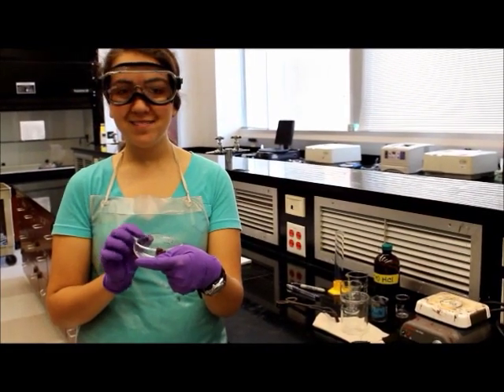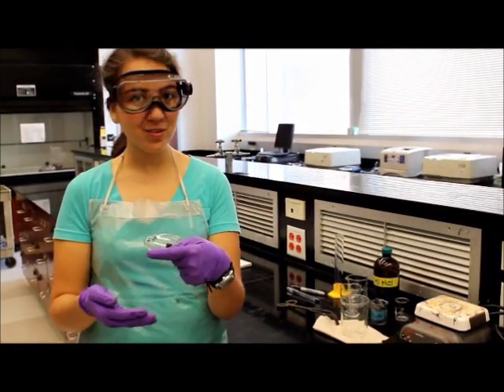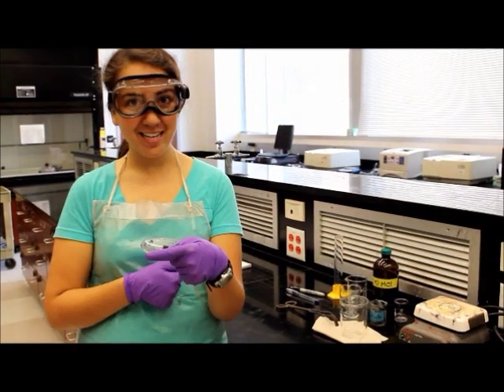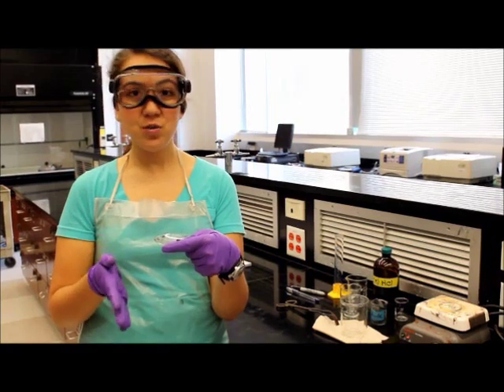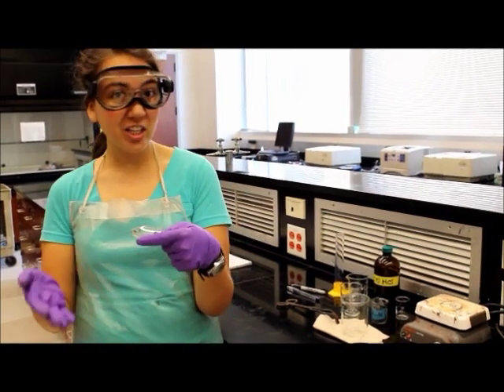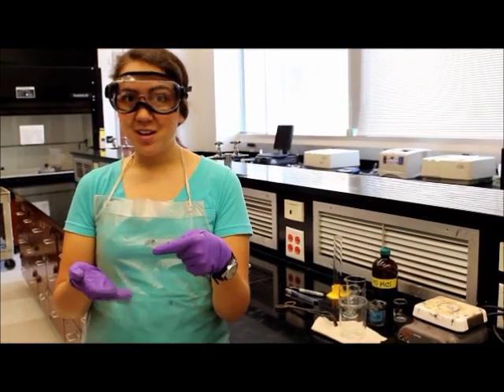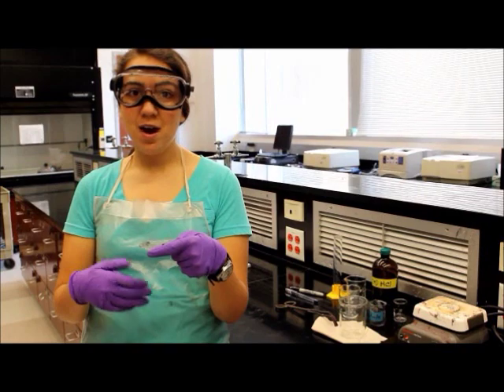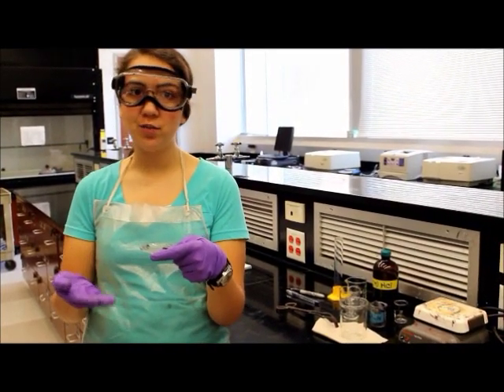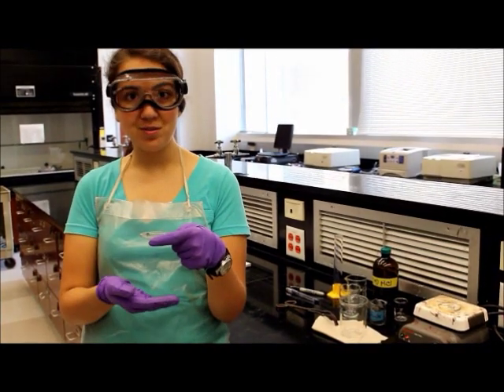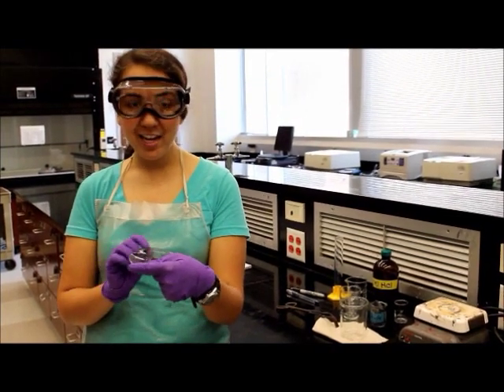One of the main things that can happen in this lab which will drastically affect your results is that someone else will take your precipitate and think it is theirs, finish their experiment, and leave. And you will go back to the oven, look for your precipitate, and not be able to find it. That will obviously skew results and you will probably not be able to have the correct empirical formula for your measurements and results. So, it's really important to clearly label your watch glass.